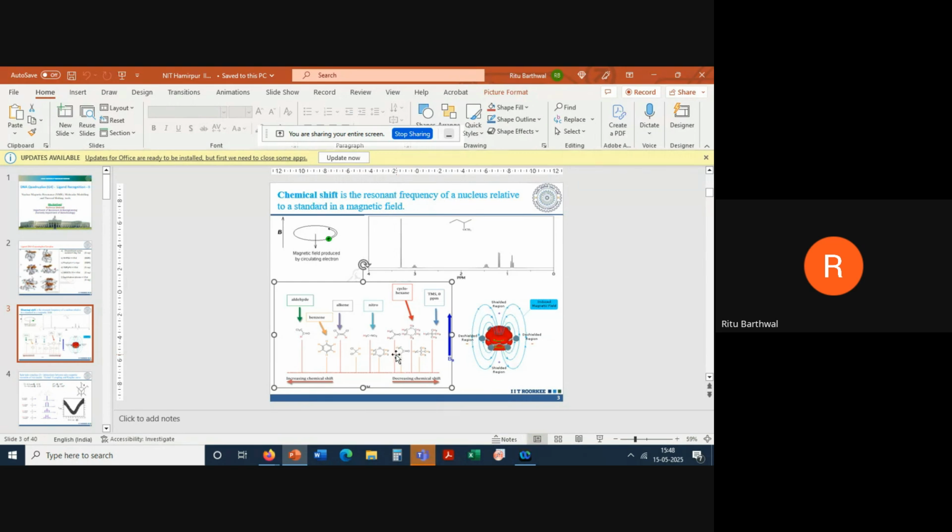If you have aromatic, once again, aromatic electrons are delocalized. So there will be a difference between aromatic CH and aliphatic CH. If aliphatic CH is here, then aromatic will be shifted towards the left of this table. Please see this graph, it is a spectrum. On the rightmost, you will have methyl. You will have something like tetramethylsilane. Tetramethyl and methyl groups will be close to that.